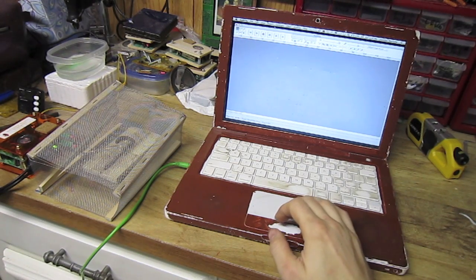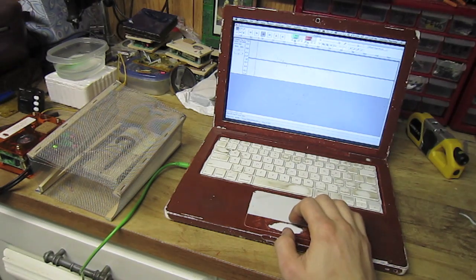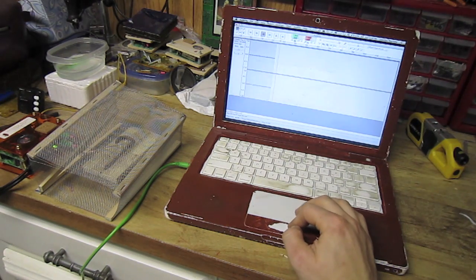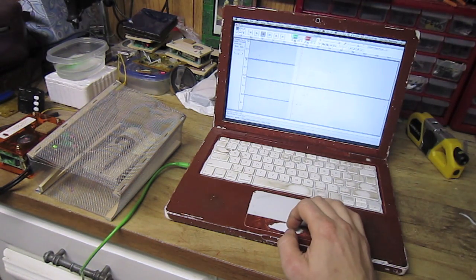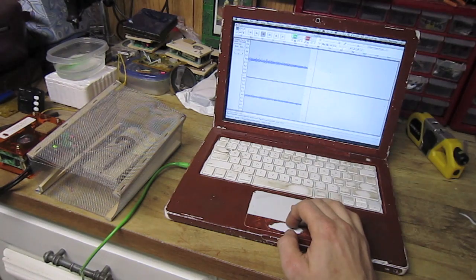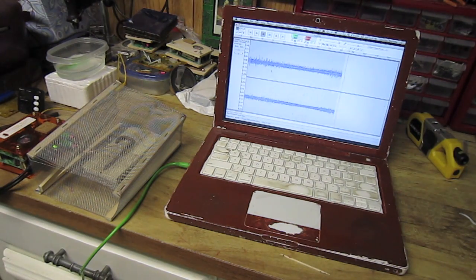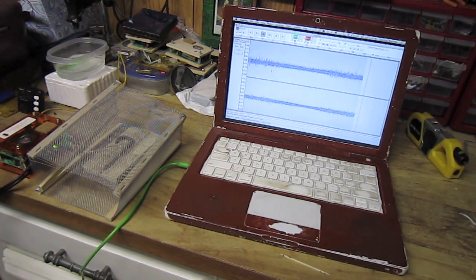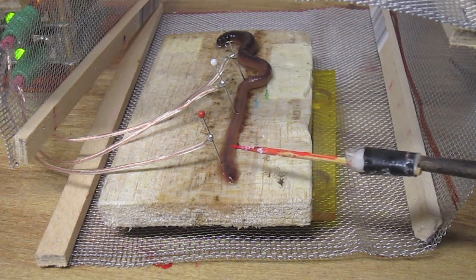Hit record, and you should see two channels of information streaming across your screen. Maximize the display of the two channels, and zoom in on the y-axis so you can see the signals you are recording. Why no spikes? That's strange. Welcome to Sparse Coding, when a single spike means a lot. Let's take a closer look.